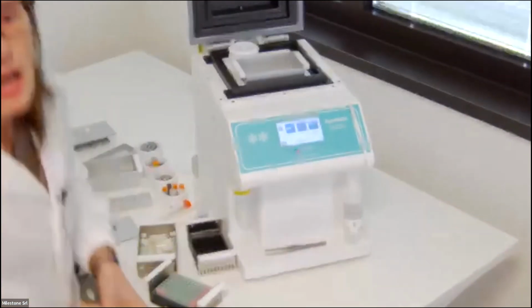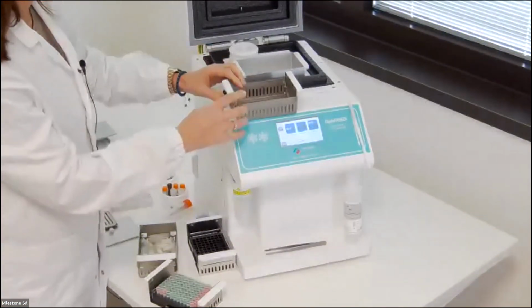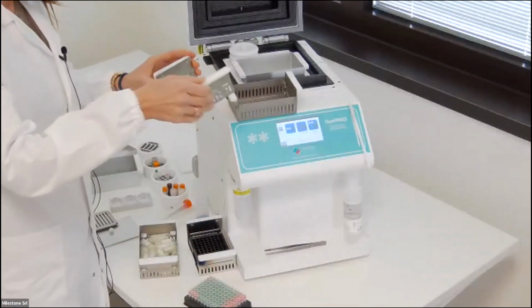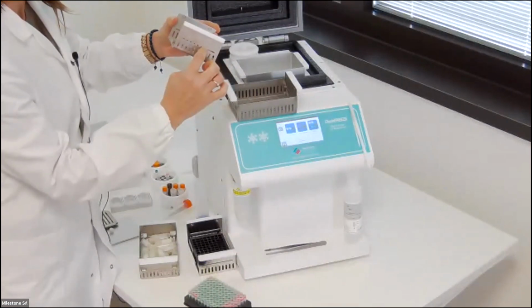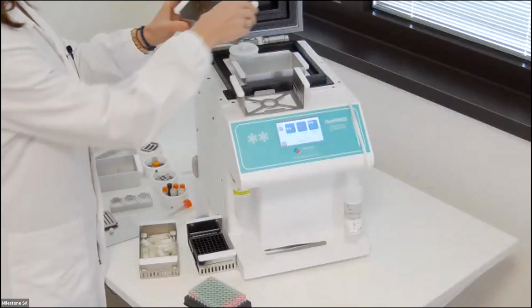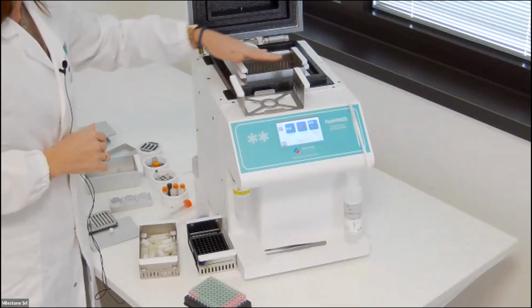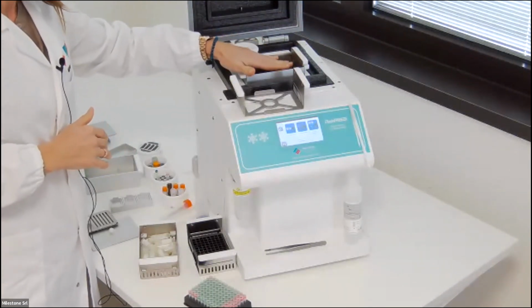As I told you before, we have 2 racks, for plate and the random rack. In both of them, we have this engraving on the lateral side, here and also here, so that when the rack is inside the freezing container, you can see exactly where the level must arrive.